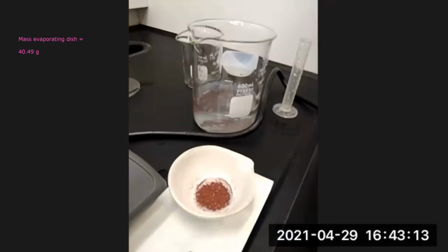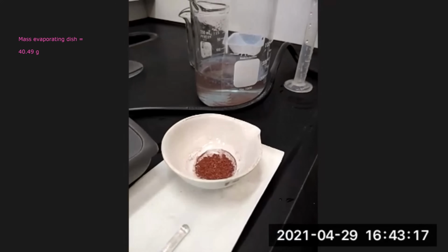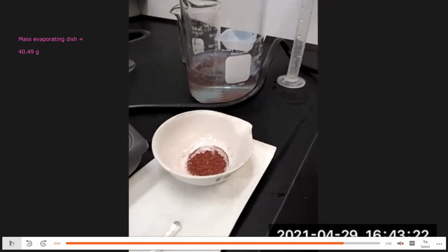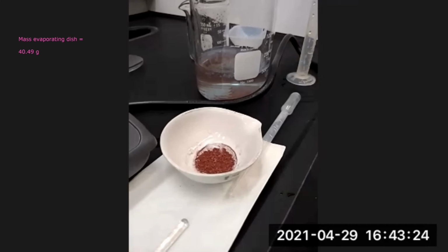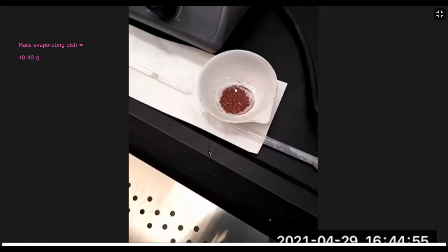See how diligently this TA is at getting all the solution out of the evaporating dish. Once all the solution is out, then we're going to place it in the oven to dry. So here, as much of the solution has been removed as is possible. So the next step is to place this in the oven and dry the copper.